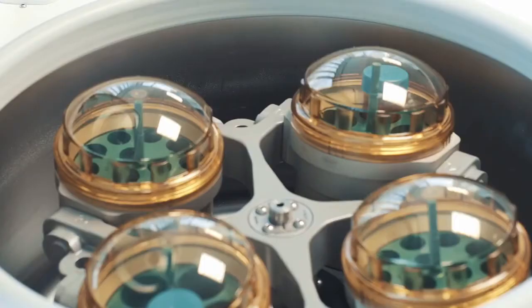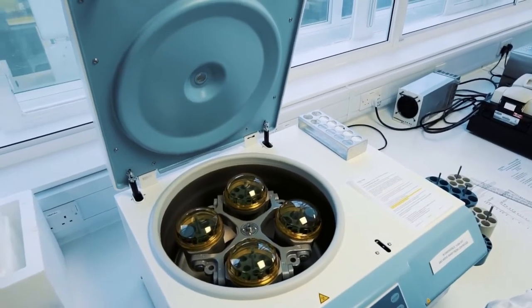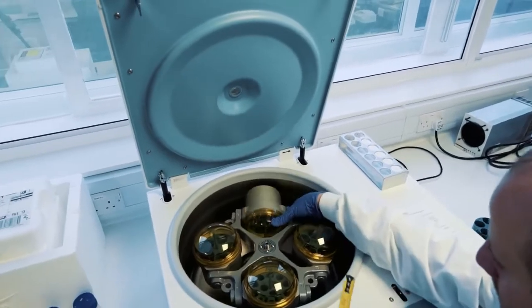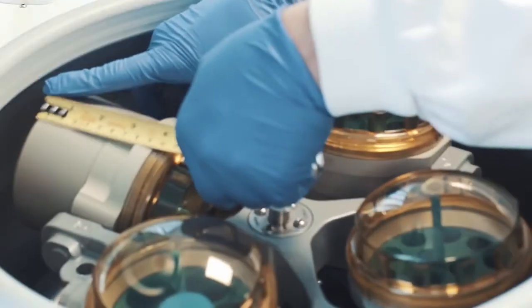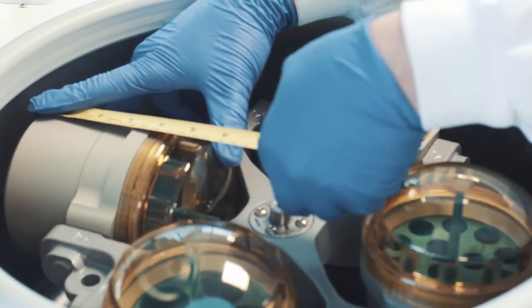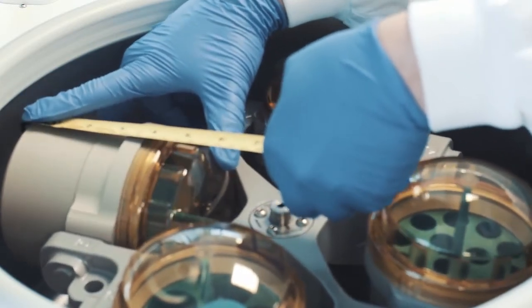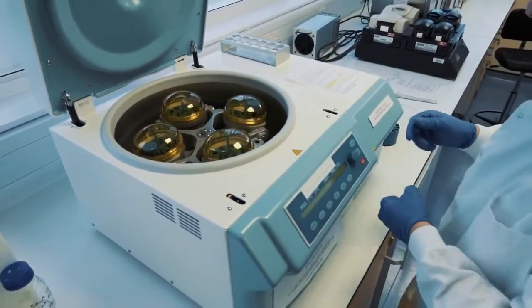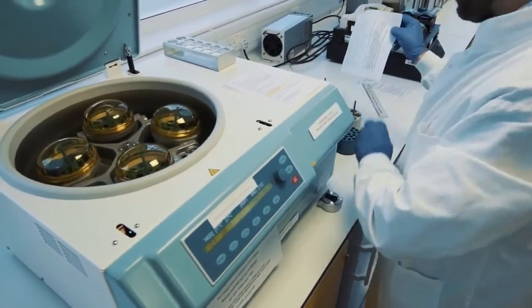However, if your centrifuge can only be set at RPM, it will be necessary to calculate what speed to use. This can easily be done by measuring the radius of the rotor, i.e. measuring the length from the center of the rotor to where the bottom of the tubes are when the rotor is spinning. This measurement can then be used on the conversion graph to convert RPM to RCF.